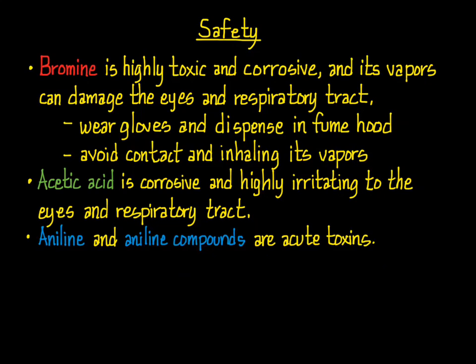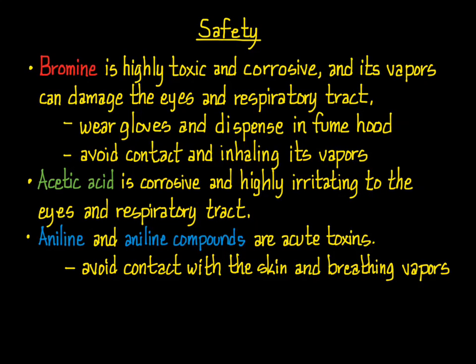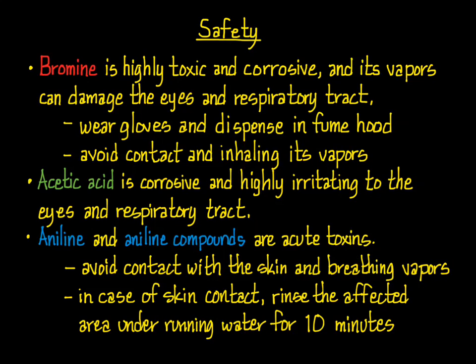Aniline, one of the starting compounds, and aniline-derived compounds, the products you make from it, are generally acute toxins. So, if you are assigned aniline as your starting material, avoid contact with your skin and breathing the vapors from aniline and your brominated aniline products. If you do get some of the aniline or aniline products on your skin, you'll need to rinse the affected area under running water for 10 minutes.